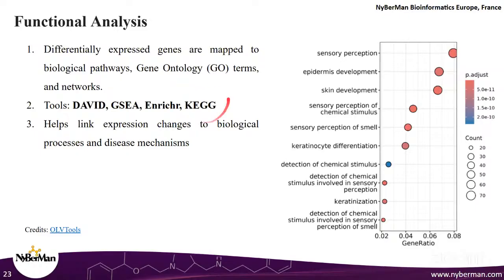Okay, there is something called PathDB, which is nothing but a pathway database. There are certain databases that help us perform this analysis as well. So these are all things that we will go through during the end stage of our internship. I think we have a session on functional enrichment. This is when we will actually use all of these to figure out the biological differences in our data with respect to the pathways and biological functions. I will show you some easy tools and, using R, how you can perform all of these analyses.